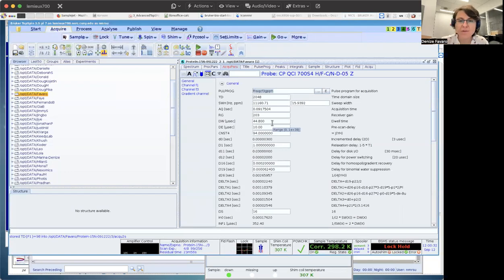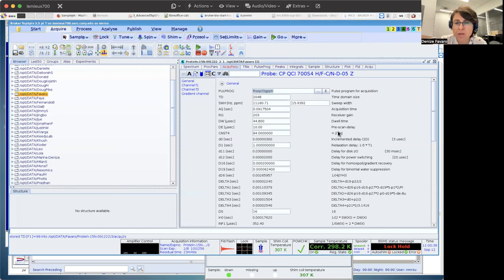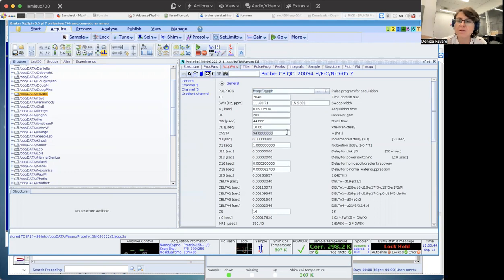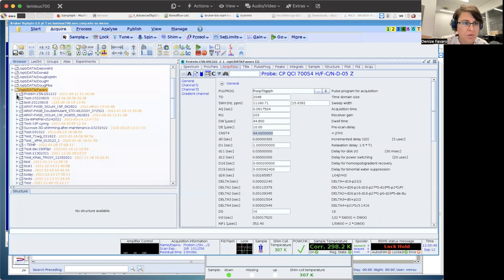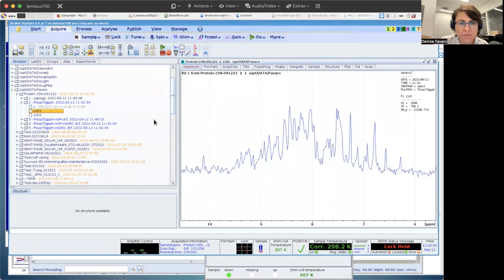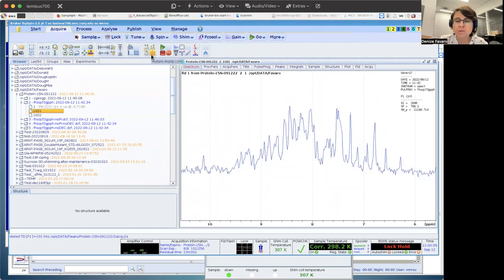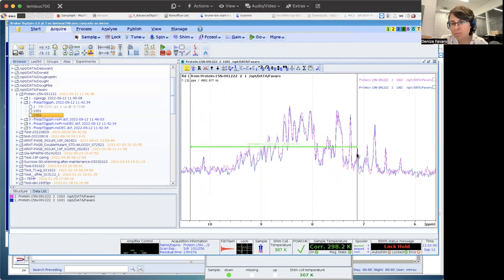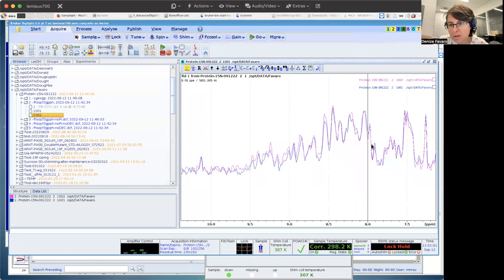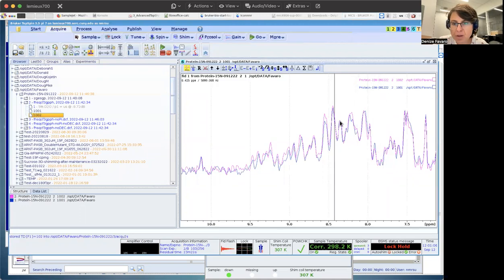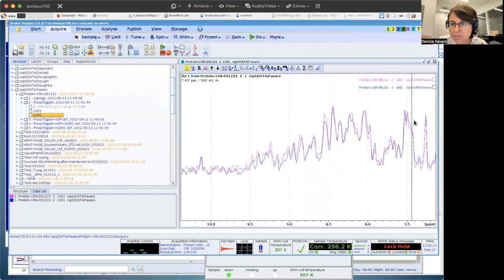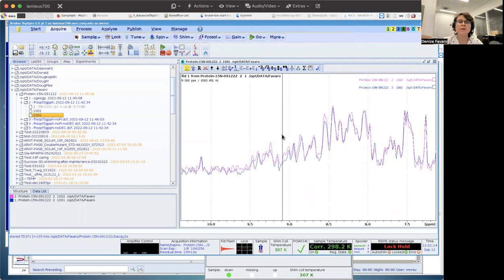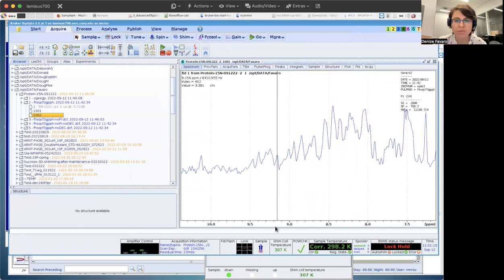Important features about this is the constant four. Constant four is the J-coupling limit between nitrogen-15 and hydrogen. So it's 90-94. For this, actually, I ran some tests. You can actually see here that I ran the first one with the constant at 90, and the second one here constant 94. I tested and realized that for most of my peaks, 94 seems to be a little bit better. So 94 is the pink one. It's a little bit better than 90. You can actually test and see which one works better for you.